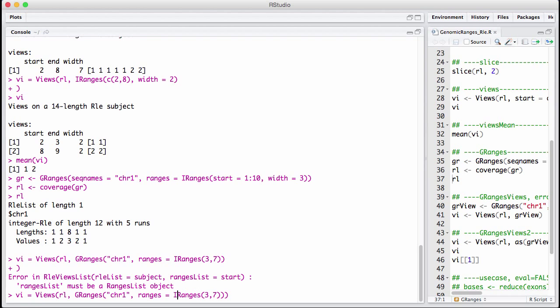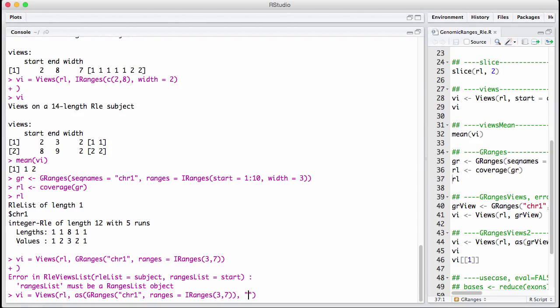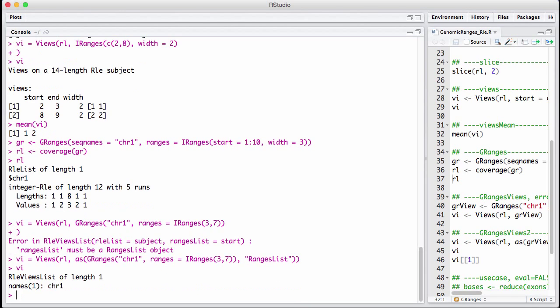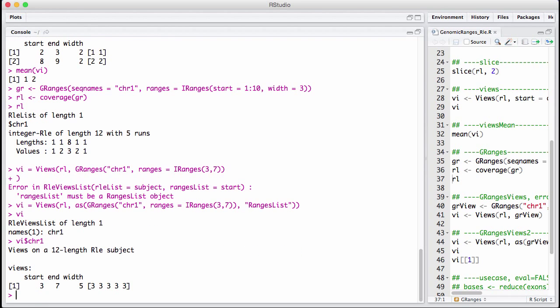So the way you really solve this is you coerce it. So you take this G range and you just say, okay, let this be a ranger's list. And now we have this RLE views list. And let's take what we see in chromosome 1. And now we have a views, exactly as we wanted from position 3 to 7.